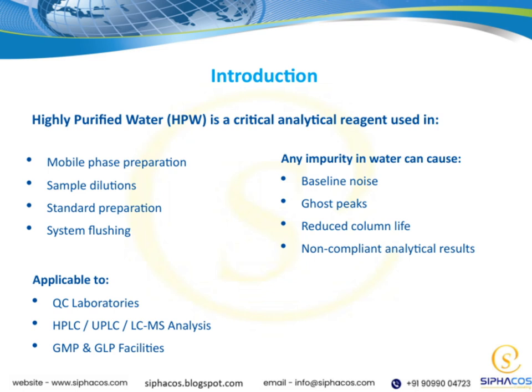Most importantly, contaminated water can result in non-compliant analytical results, risking the validity of our data.